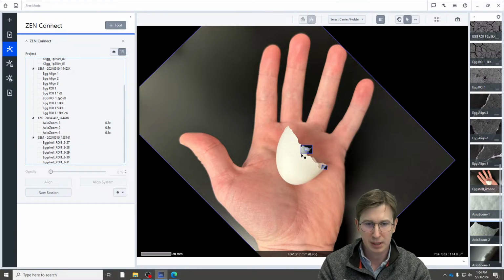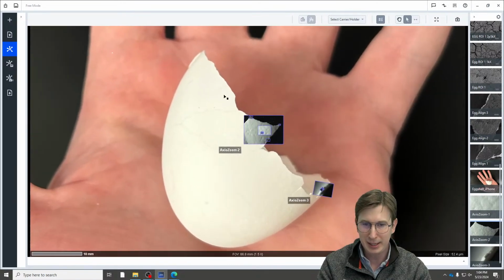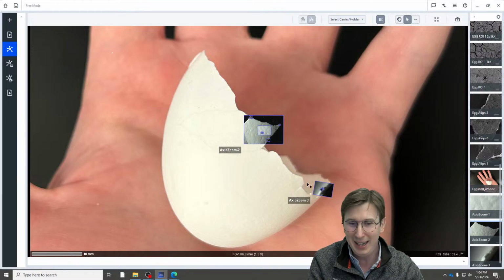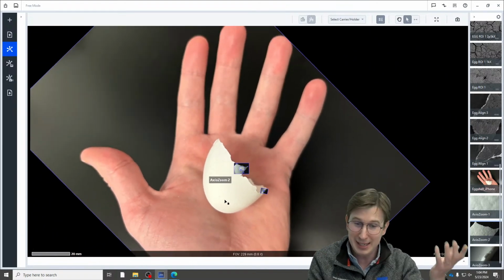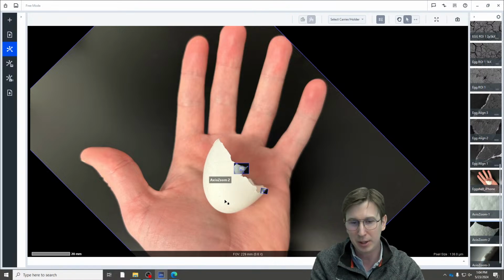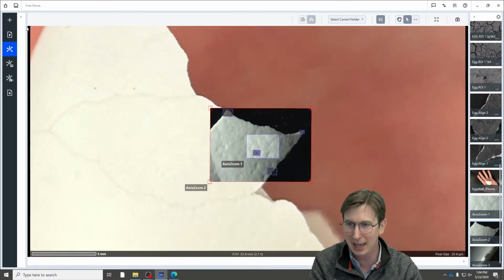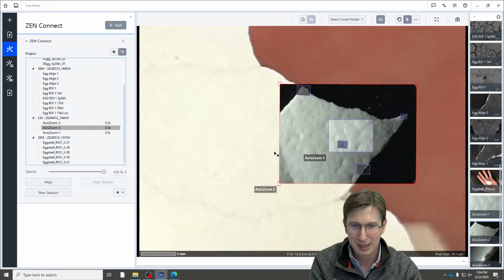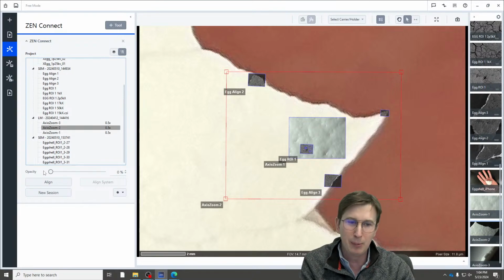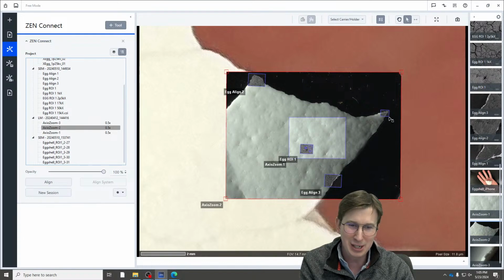So let's push in a little bit. I could hide this. And so here we see the overall eggshell. Now, to give you a little insight into the movie magic of what you saw, this eggshell that I took a picture of, I did that before preparing the sample. I had the eggshell in my hand, took a photo of it with my smartphone, and I noticed that this part was sticking out, was kind of obvious. So if I bring back my layers, fade it in and out, so we can see underneath, that part was attached to the egg.